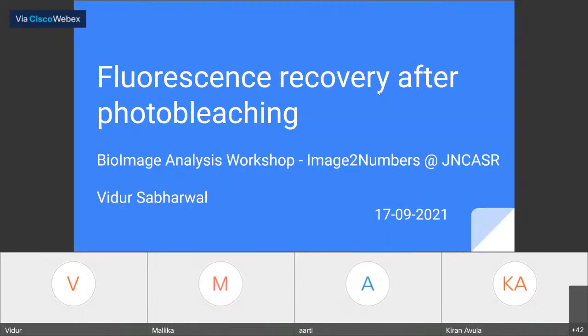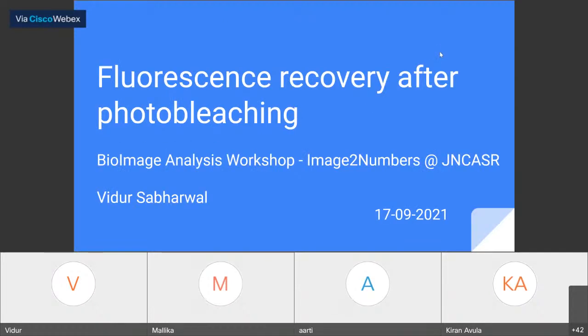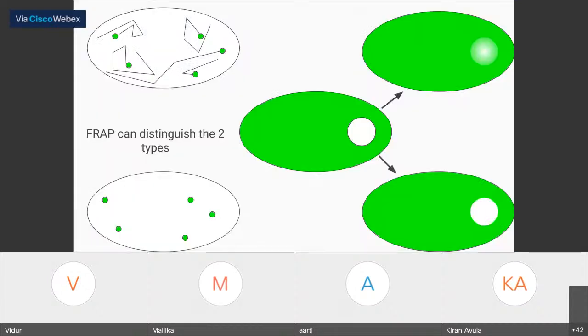Yes. Okay, thanks. Thanks a lot for the introduction. What I'm going to talk about is, as I said, fluorescence recovery after photobleaching. So the first question to ask is, what is it required for? Why is it needed? The most obvious answer that most people use it for is to assess.